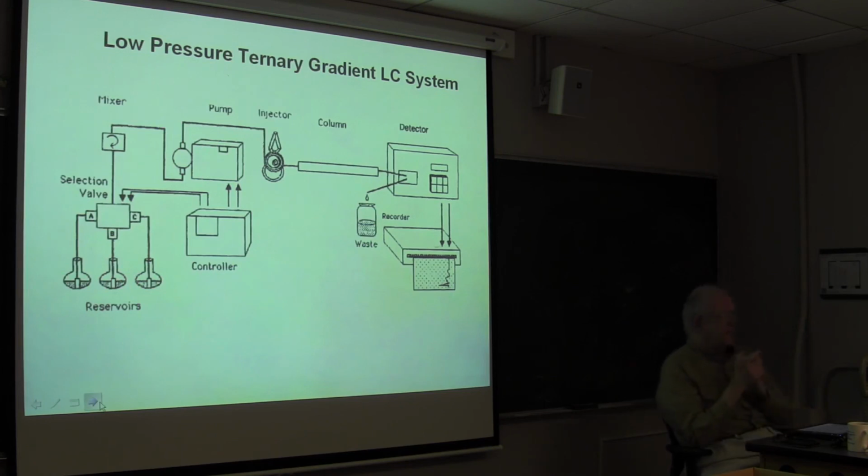So there's another way to do complex gradients. And I'm just illustrating this with a ternary gradient system. But I think most commercial instruments are actually quaternary, meaning they can handle 4 liquids. And it's done in the following way.